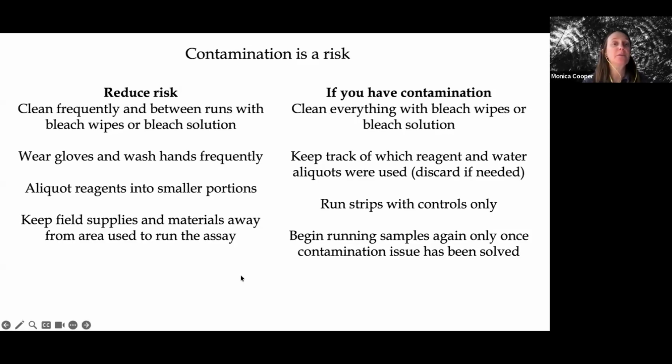Okay, so in order to reduce the risk of contamination, we recommend that you clean your workspace and equipment frequently with bleach wipes or a bleach solution. We wear gloves and we change them between steps. If we're not wearing gloves, we're washing our hands frequently.